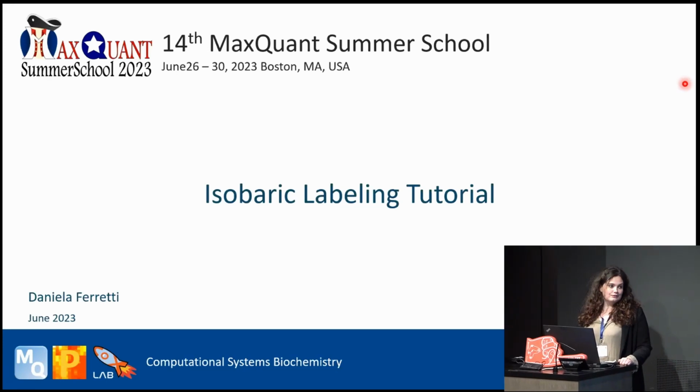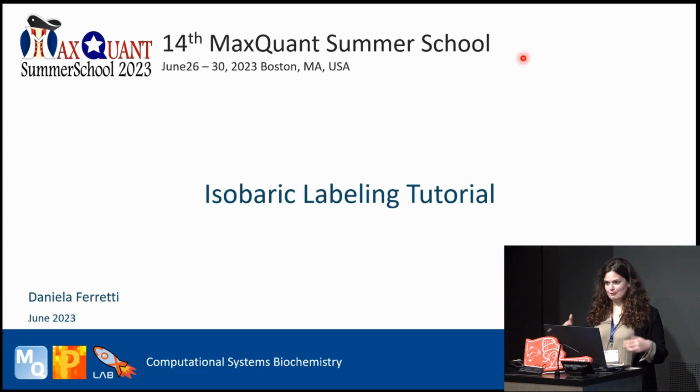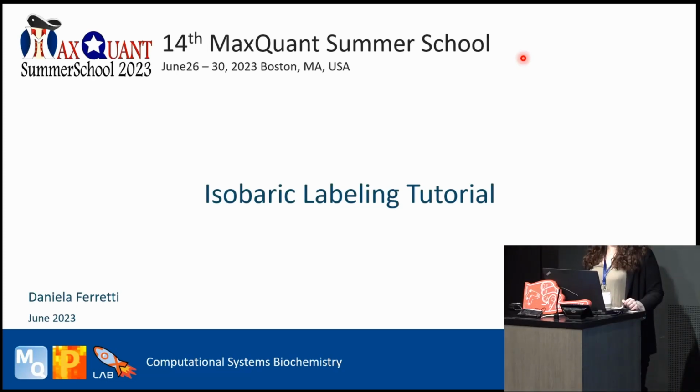Okay, good afternoon. And yes, it's me, Daniela Ferretti, and today I will present the tutorial of isobaric labeling. Christoph will present you the theory behind it, and now we will do the tutorial.